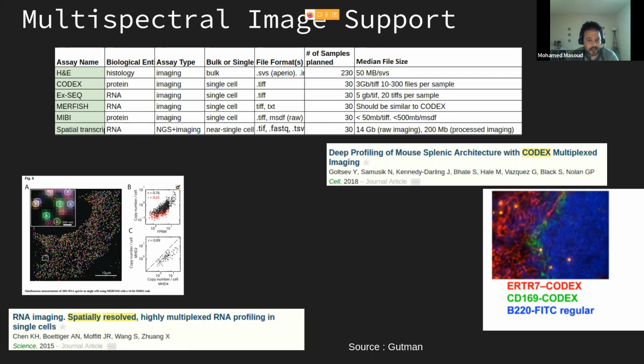Here is an example of two of these technologies. Codex is a recent one that comes, I think, from Stanford University. It mainly uses a protein panel and has the ability to get maybe 40 different proteins in the same image.